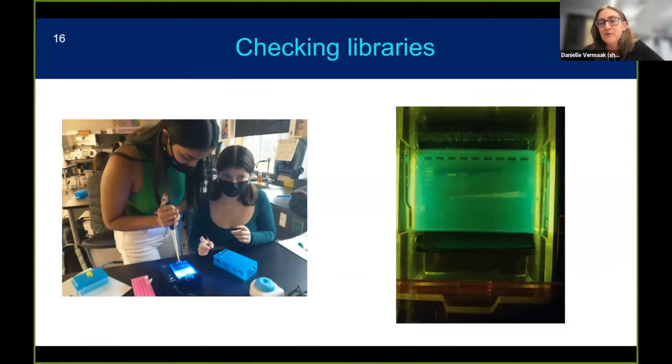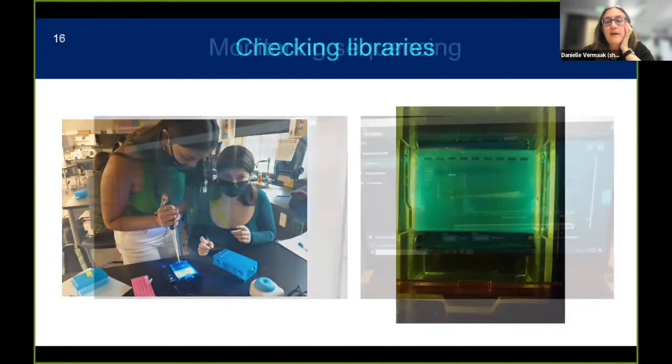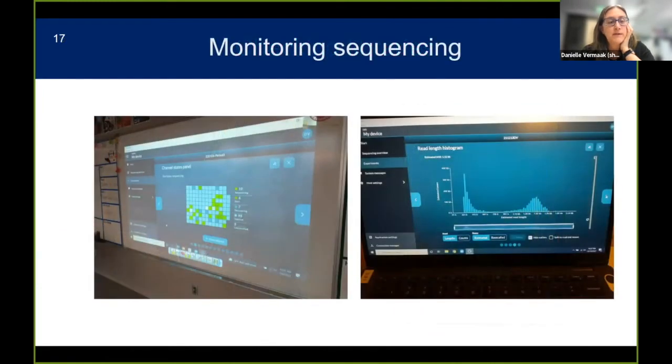So metagenomics was another thing that we really wanted students to wrap their heads around: with normal culturing, you would only be able to see about 1% of what's in your sample, but by going for direct DNA isolation and sequencing, we get to see so much more. I believe this is over to you, Chris.